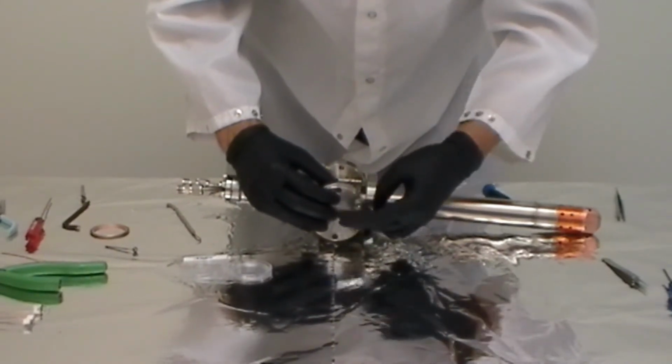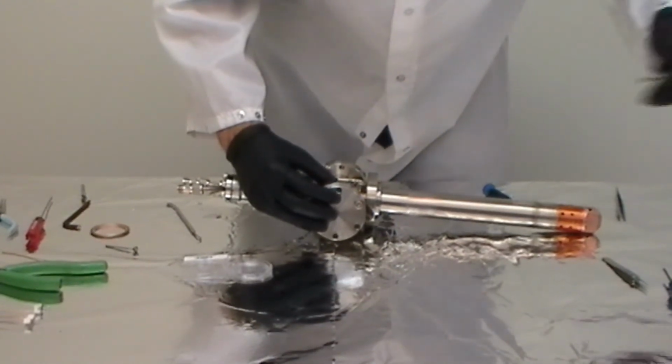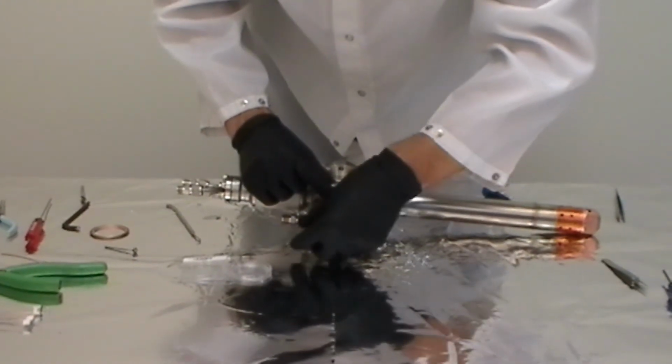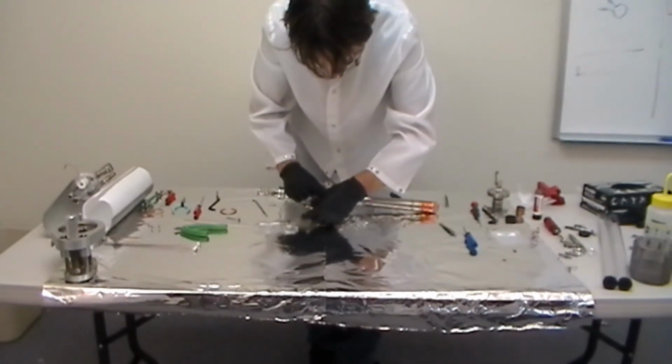If you don't have that information, please contact us at rbdinstruments.com. We'll be glad to help you. And congratulations, you have successfully rebuilt your 04548 or 04500 X-ray source.